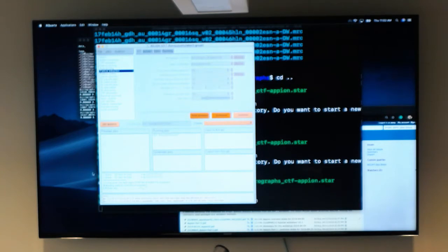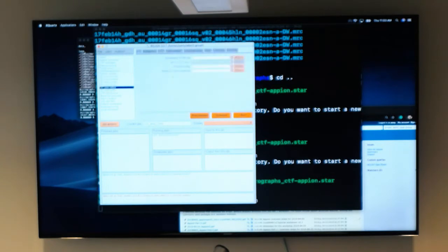Okay, so we're going to go around. You're going to start following the tutorial, and hopefully you run into errors, because that's the point where you can get help, you can explore the environment, see how the GUI feels, know how to submit jobs. Right now, only submit one job at once. So the last thing I went over is, or I'm going to go over, for extraction, you're using CPUs. How do you run a job with GPUs? Let's say auto refine. You'll need an input star file, a reference map.